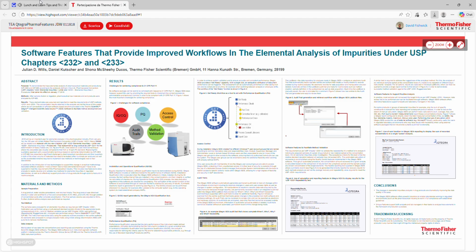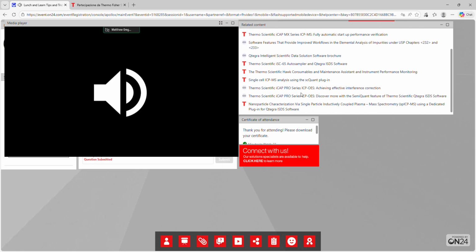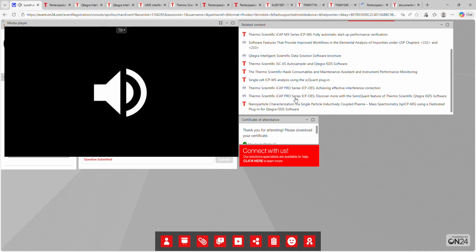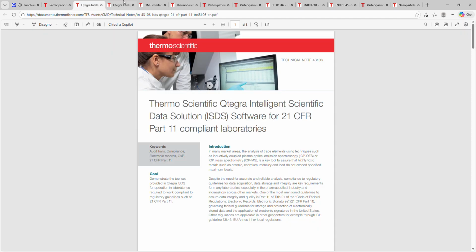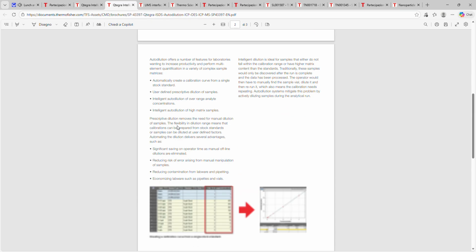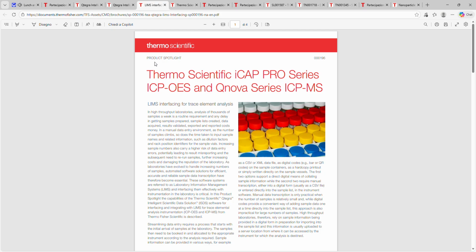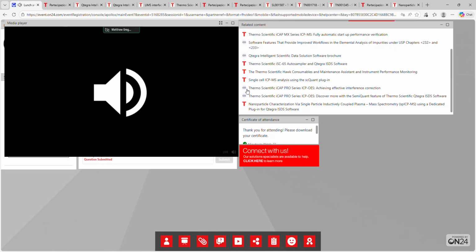Okay, yeah. So maybe as you make changes, it does reorder, but there should be a button next to the ordering which saves that order, so we can do that. If you're still having problems even using that save, what we probably want to try and do is save that within the template. So get the order right first, save it in the template, and then it should be okay going forward if we click the button that's next to the sorting that says keep this ordering. Hopefully that will work.